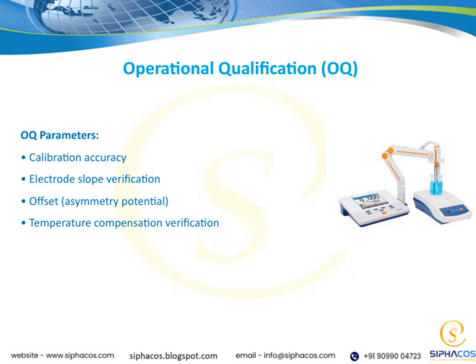All these parameters are interconnected. They collectively assure that our equipment is performing optimally before we proceed with sample analysis. Remember, thorough OQ is the foundation for reliable, consistent data in any analytical process.